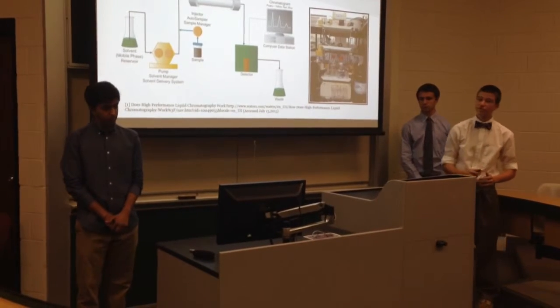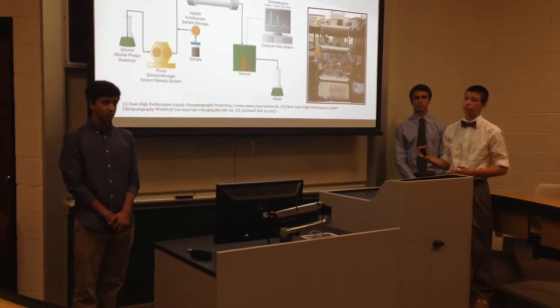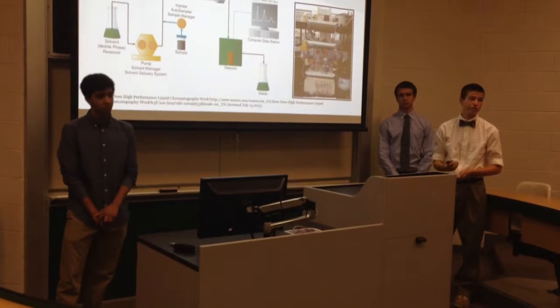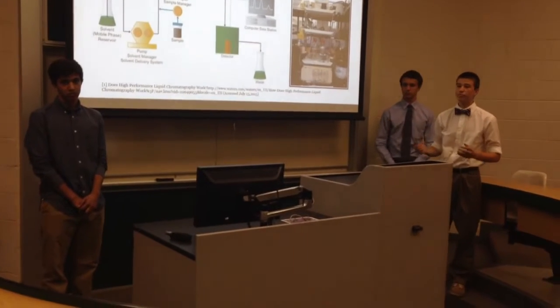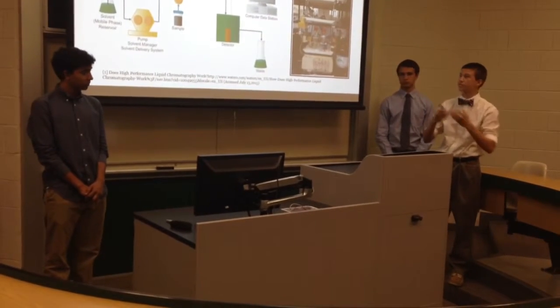And then after the samples were taken out of the dissolution apparatus, we needed to separate them through high-performance liquid chromatography, because all these vitamins absorb at a similar wavelength of 275 nanometers, and if we didn't put it through this machine, if we just put it straight to the UV detector, there'd be one massive absorption peak, because all the vitamins are stacked on top of each other and those peaks combine.